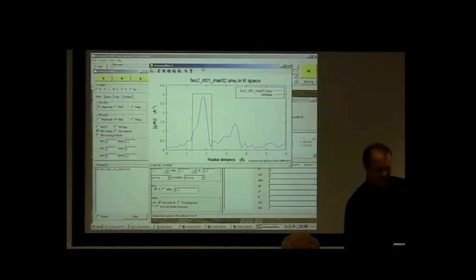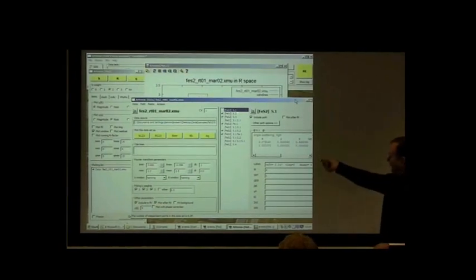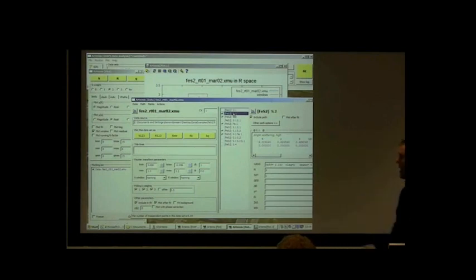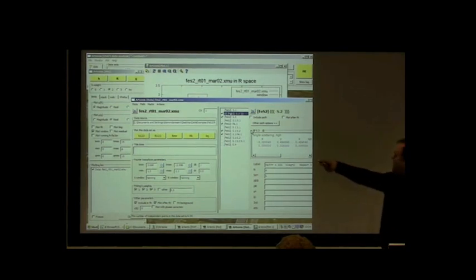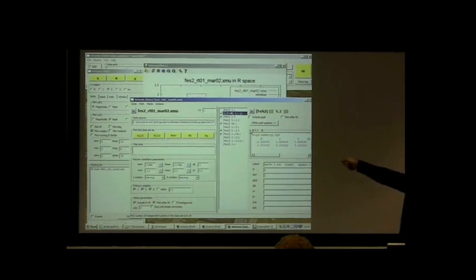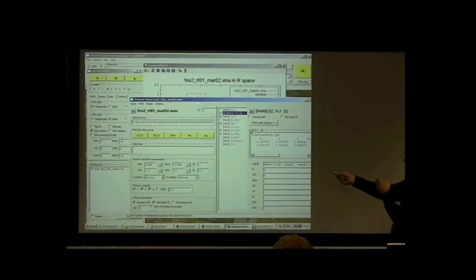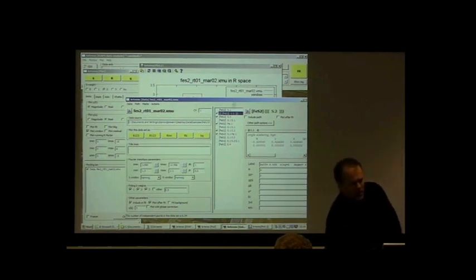Now the other thing we have to do is include just the first path. There's a number of ways to do this. We could click on each one that's not in the first path and unclick the button that says Include Path. That gives you this little visual clue that it's been taken out of the fit. That means that this path is not going to be used to evaluate the fit, but it's still here and available to you should you want to come back to it later. So when we go and do the fit to more of the data, we will include some of these other paths.